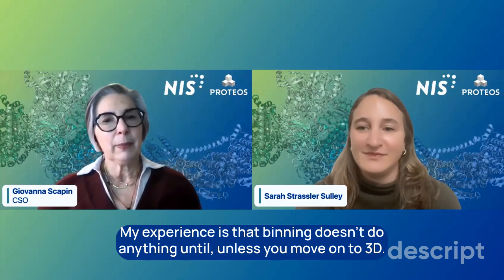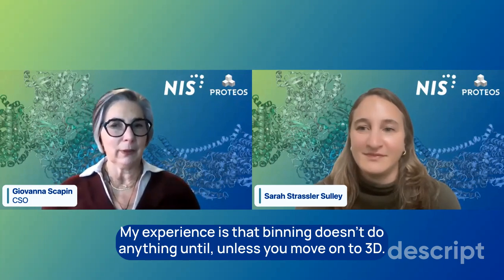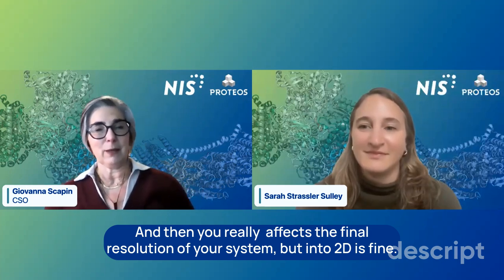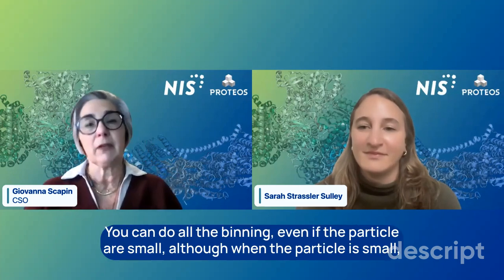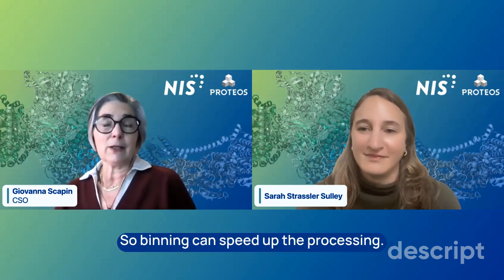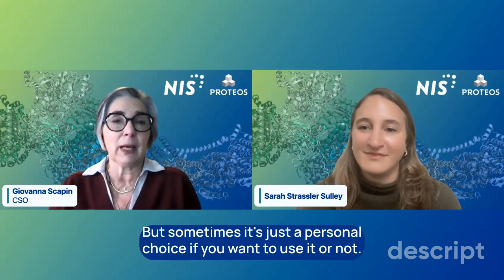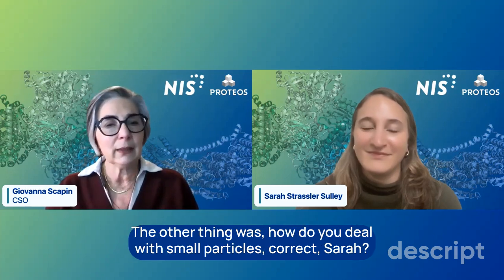My experience is that binning doesn't do anything unless you move onto 3D. And then it really affects the final resolution of your system. But in 2D, it's fine. It's not going to affect anything. You can do all the binning, even if the particles are small. Although when the particles are small, you end up using a much smaller box size. So binning can speed up the processing, but sometimes it's just a personal choice if you want to use it or not. The other thing was, how do you deal with small particles, correct, Sarah?